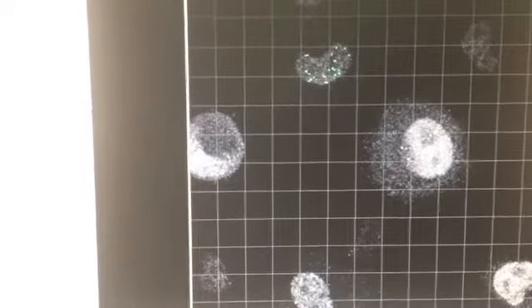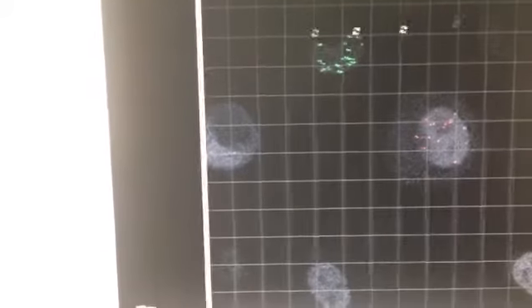So I'm just going to take off some of this. And we'll just deselect all of these, so we'll go back to a normal looking population here. Okay, so what we want to do is hit this little button here to create some new spots. So we hit that. This should bring up a new window which looks something like this. It looks a little bit different on the newer versions.